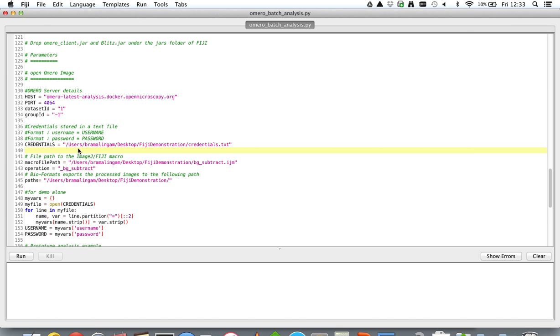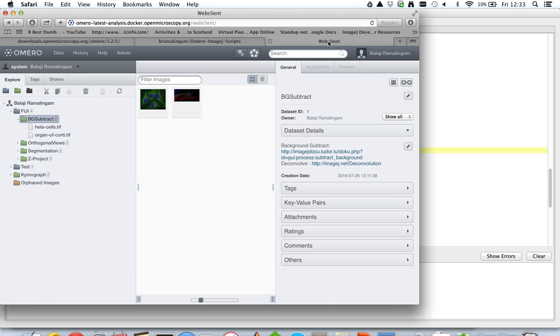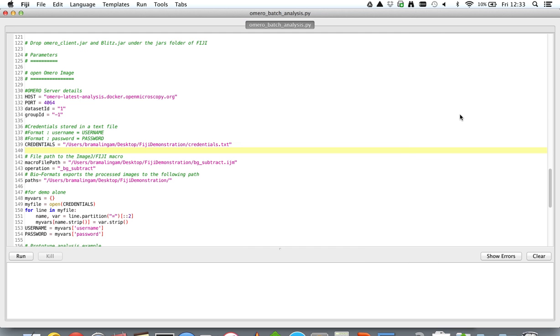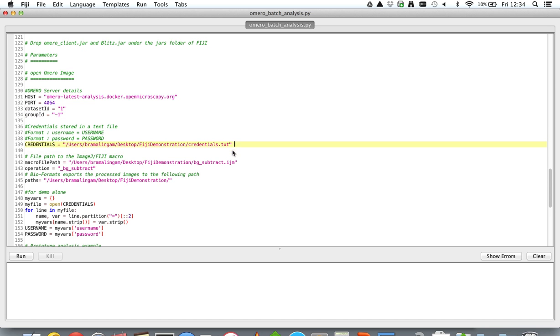Now let's look into the server. This is the dataset that I'd like to process and it has a dataset ID 1, and this is the server address. So I've updated the server address over here, the dataset ID is 1, and pointed at the credentials file, the macro file, and then where I want to write out the processed images.